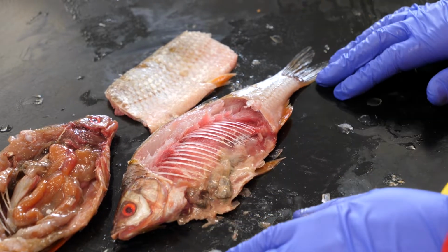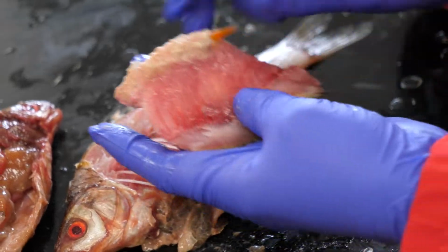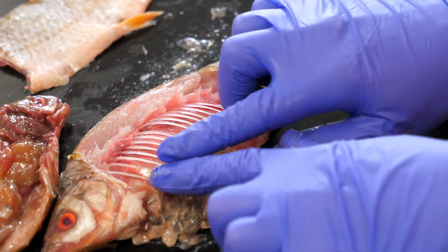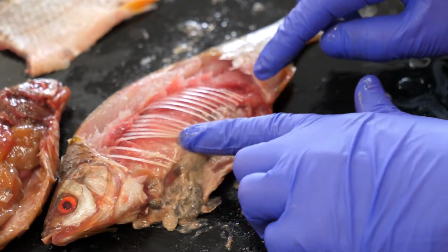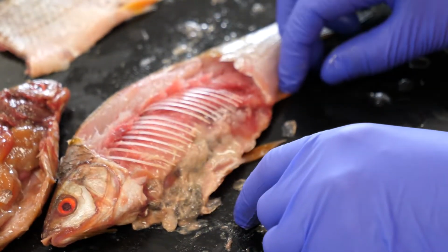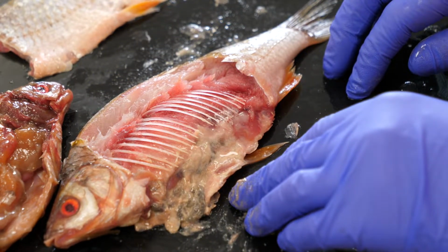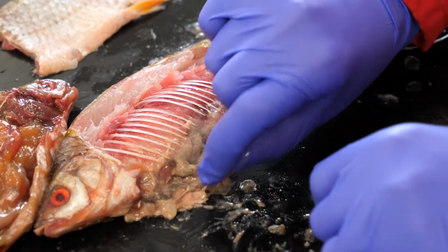Okay, so this is our bony fish. I've just taken off the scales and the muscle underneath. Before I open this fish up properly, I want you to just notice the bony ribs going across the side of the fish. Obviously, sharks don't have this, so this is a really nice example. We can see down at the bottom here a bit of intestine.